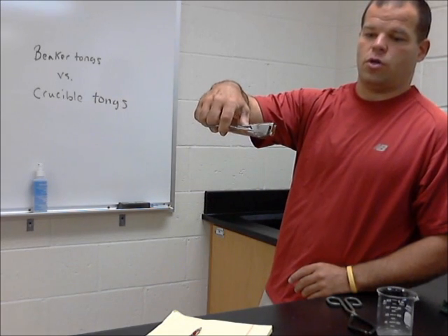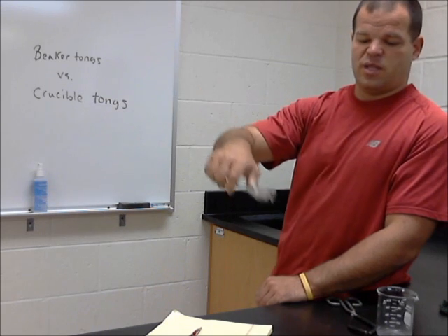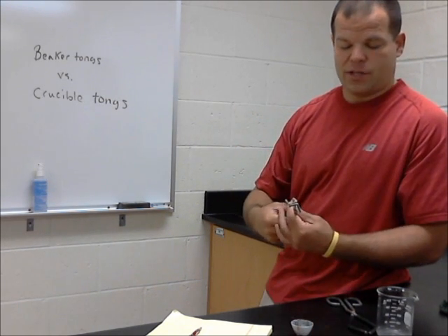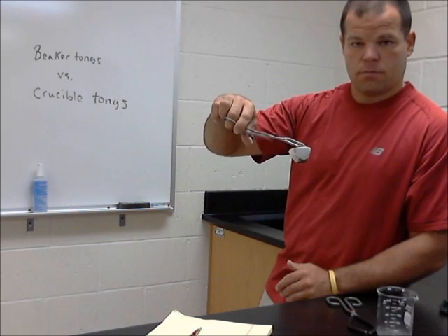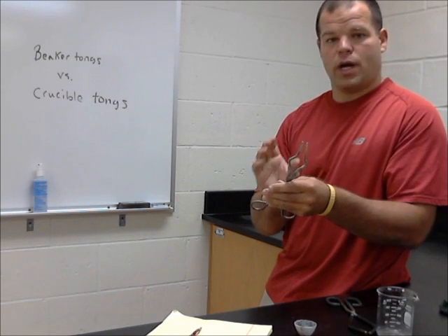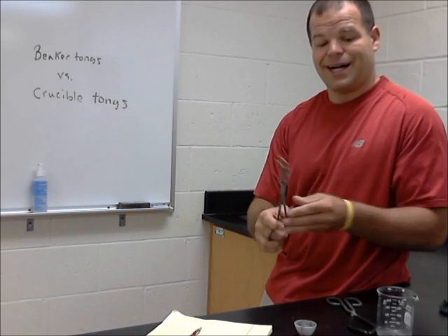It doesn't matter if this is all the way together or not, I'm just going to pick it up and then set it down wherever, and there you go. I don't necessarily want to see someone picking it up like this. Okay? So in this case, what would happen if you try and use a crucible tongs on a beaker?